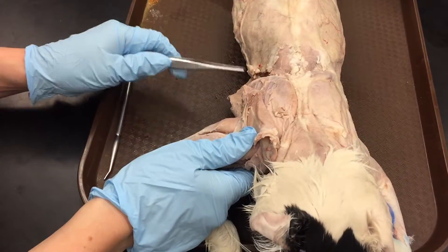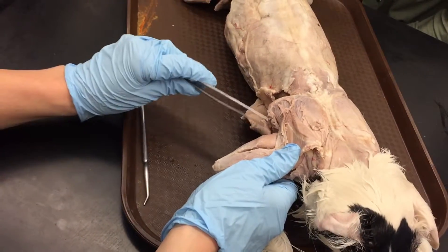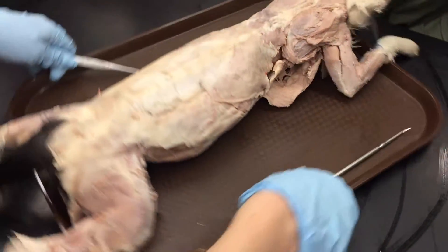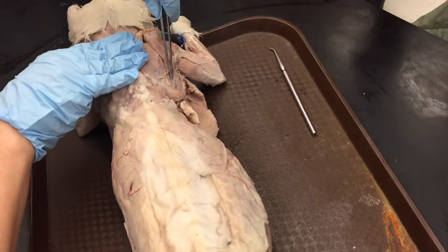Supraspinatus, infraspinatus. And then this ridge, this hanging muscle on the end, is the teres major. It pretty clearly hangs off the bottom. Teres major — which goes all the way around, and it hangs off the infraspinatus.